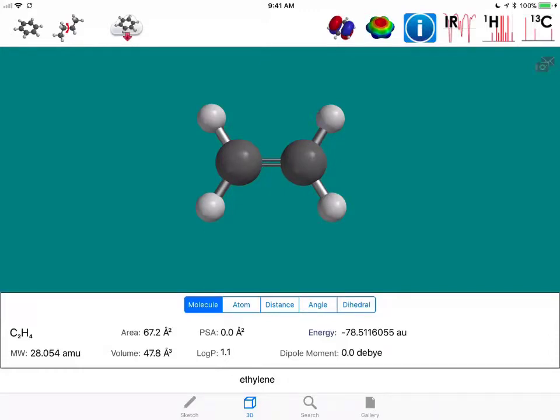In this organic chemistry screencast, we're now going to look at the functional group alkene, the specific molecule being ethylene.